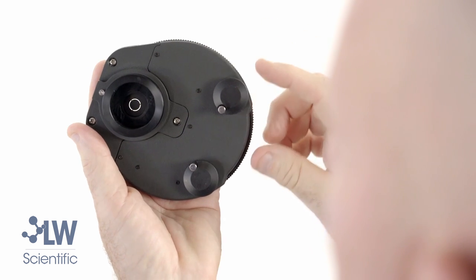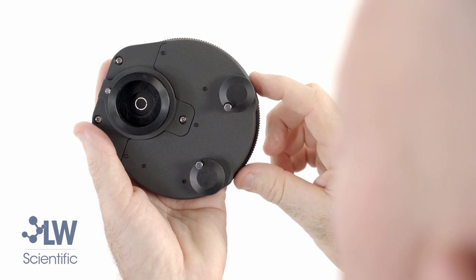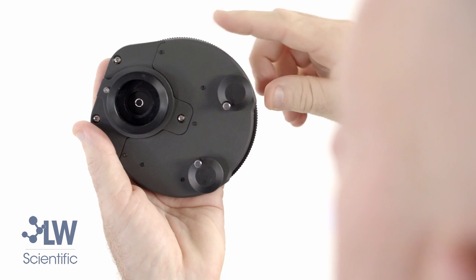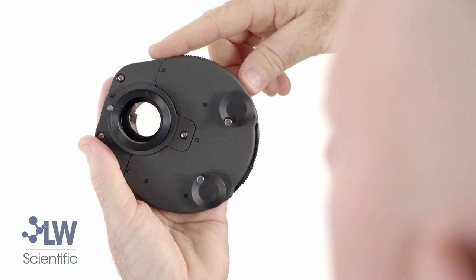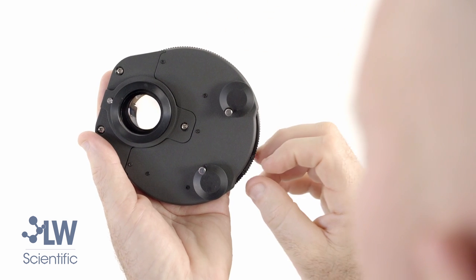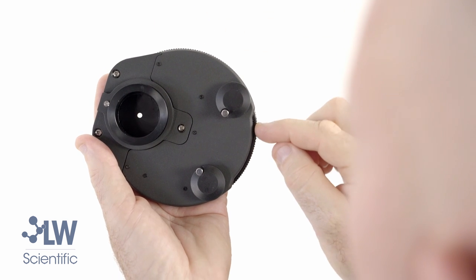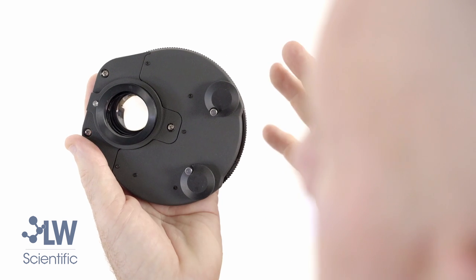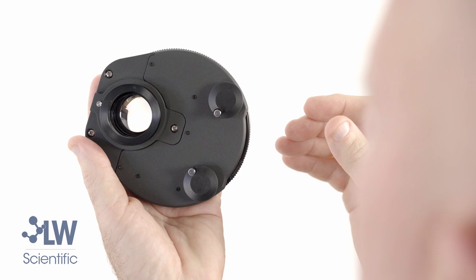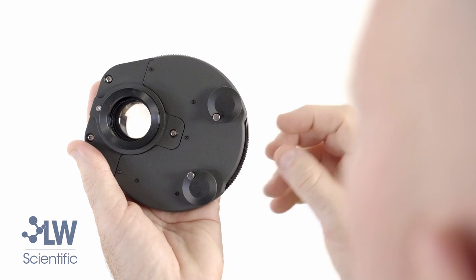There are different size rings — there's the 40x and the 10x/20x. This turret also has a bright field setting with an iris control. Notice the little tab here controls the iris. In this setting you can use your microscope just like a normal cytology microscope in bright field.